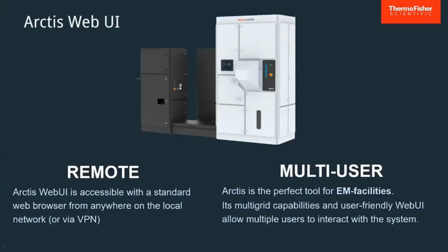The unified single software concept brings certain advantages. In this case, we don't have users sitting next to the microscope to work on their samples. The samples can be loaded via the autoloader into the microscope. The microscope can carry up to 12 samples, and it's possible to access the WebUI software remotely.